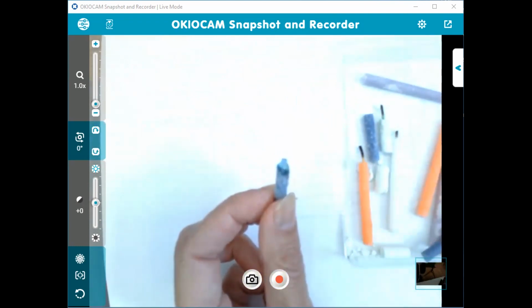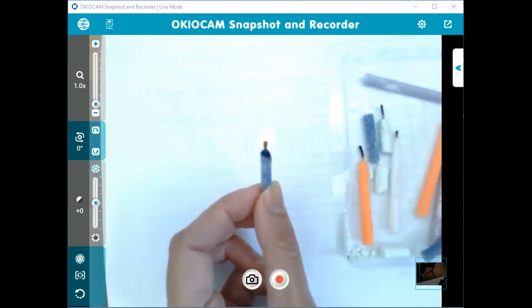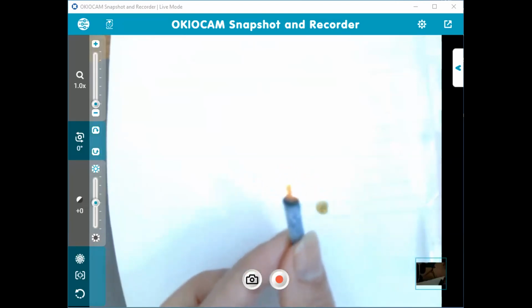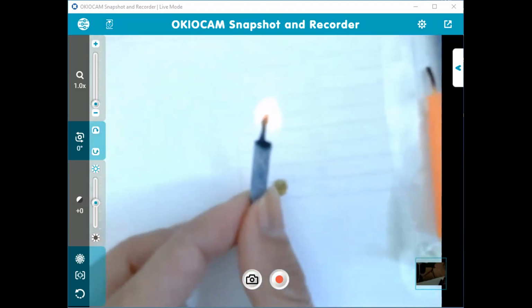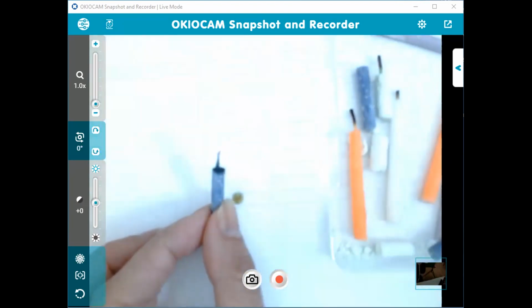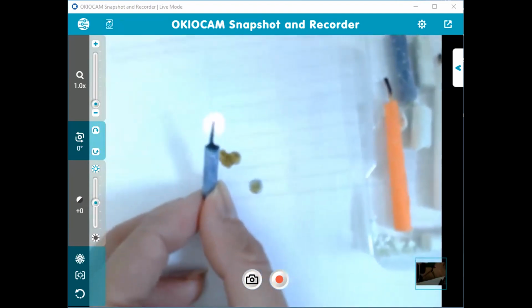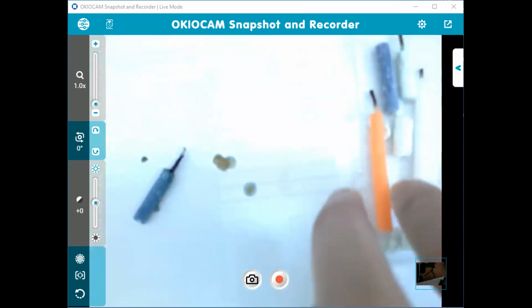And do you see a blue flame? No, it's way too bright to see anything. Let me see if I can get closer. So I see kind of an orangish flame. Oop, it's way too bright to see anything. Let's try this angle. Okay, so I see kind of an orangish flame with a very low blue. Let me try to shield that. So it's an orangish flame with a very low amount of blue. Let's blow that out. Not useful.